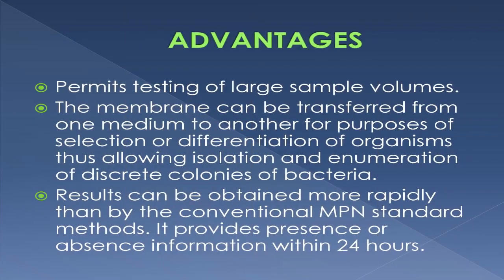An advantage of this membrane filter technique is that it permits testing of large sample volumes.